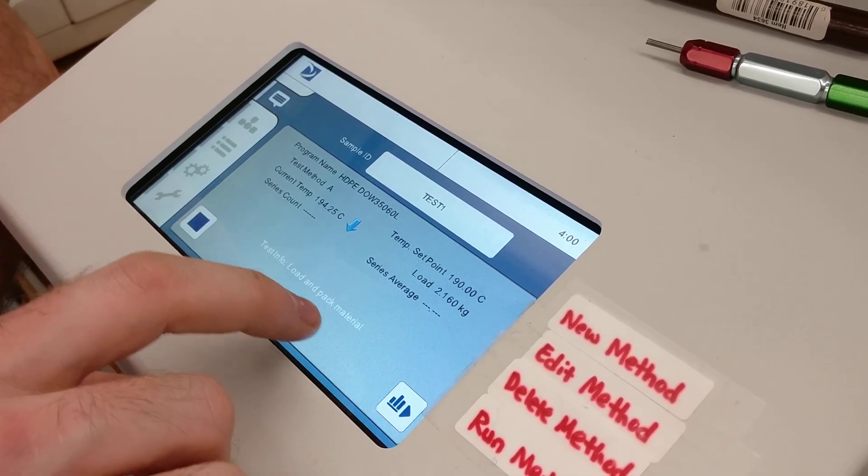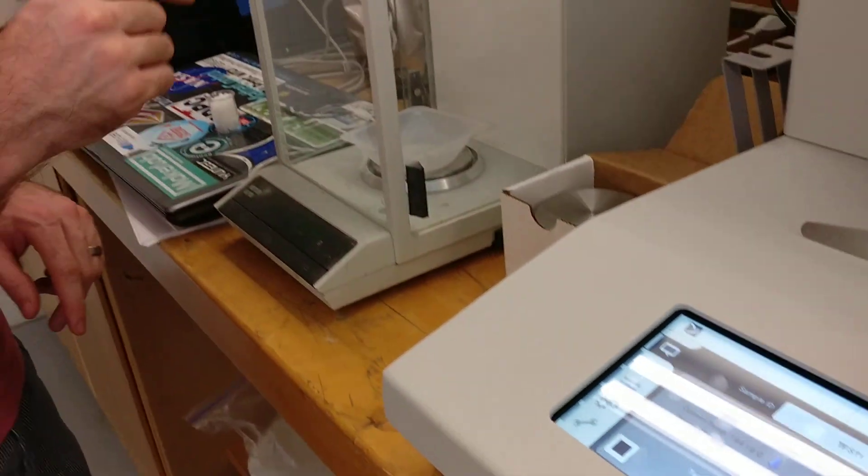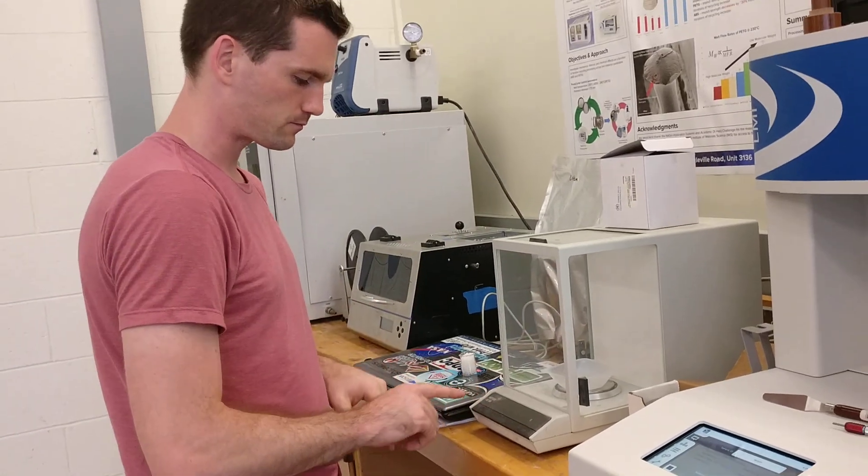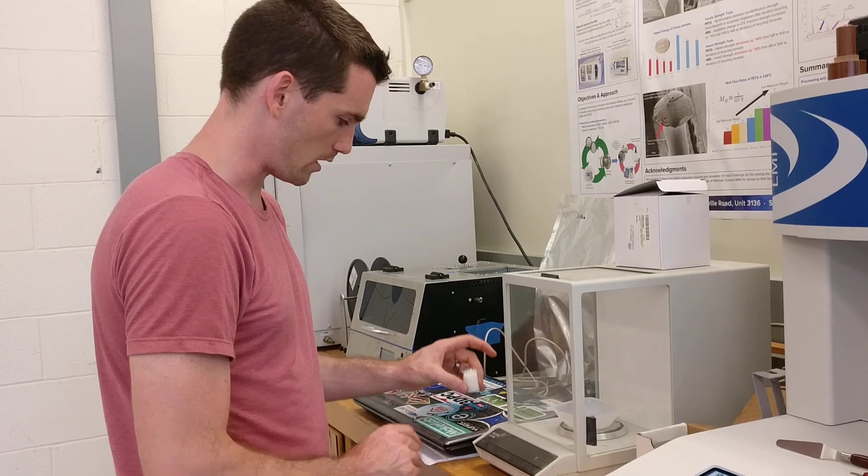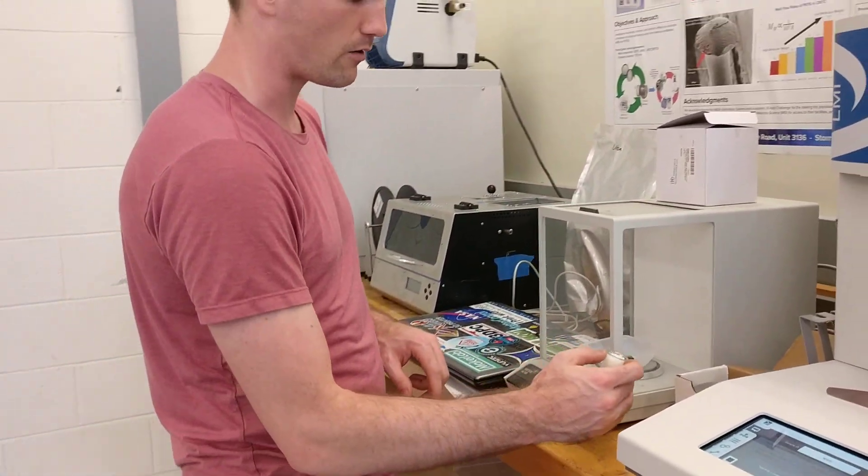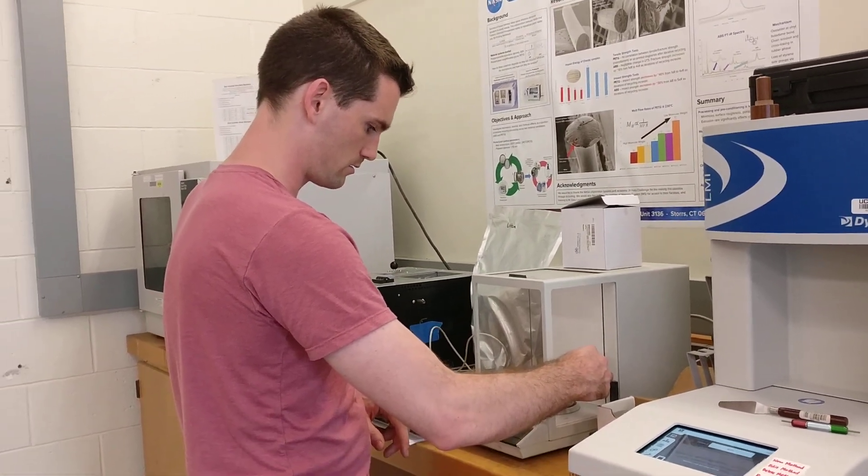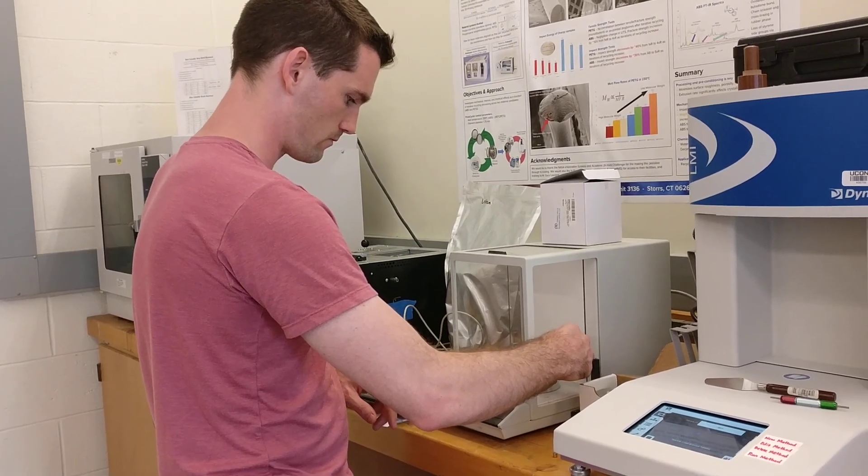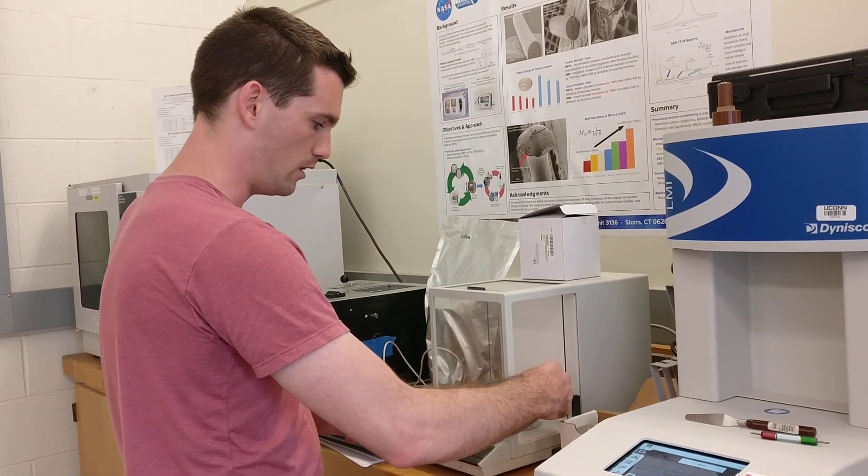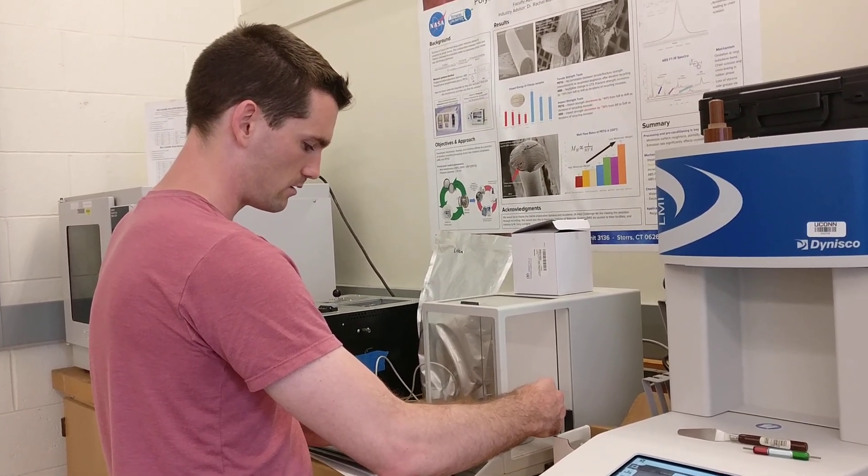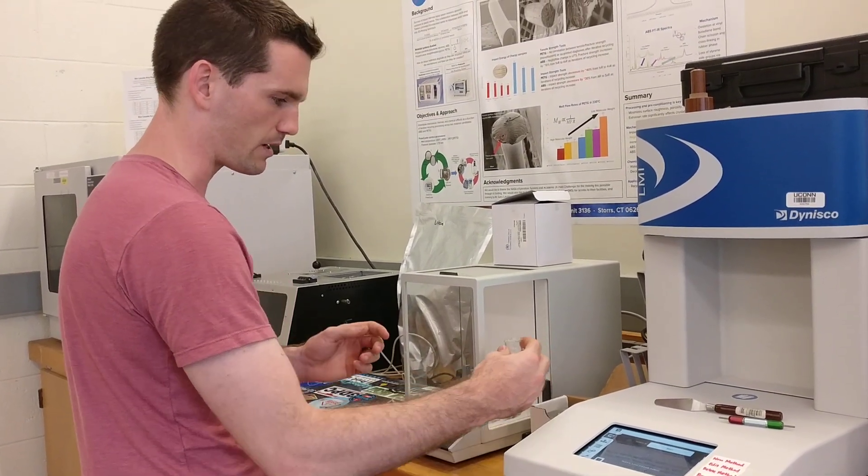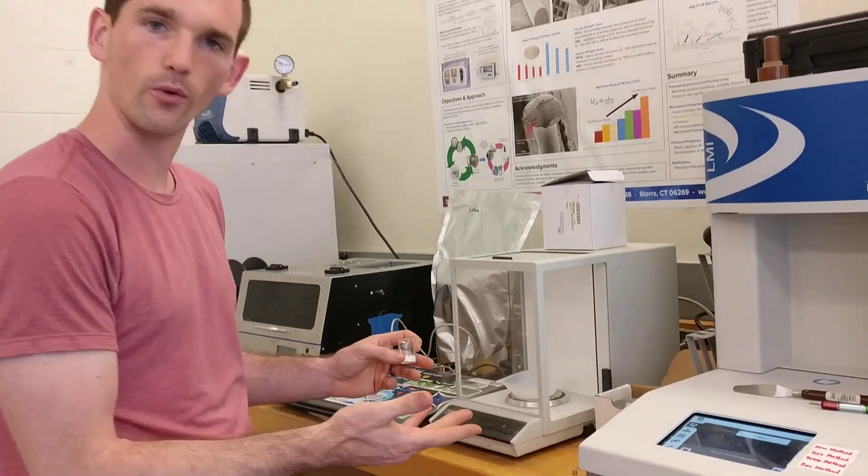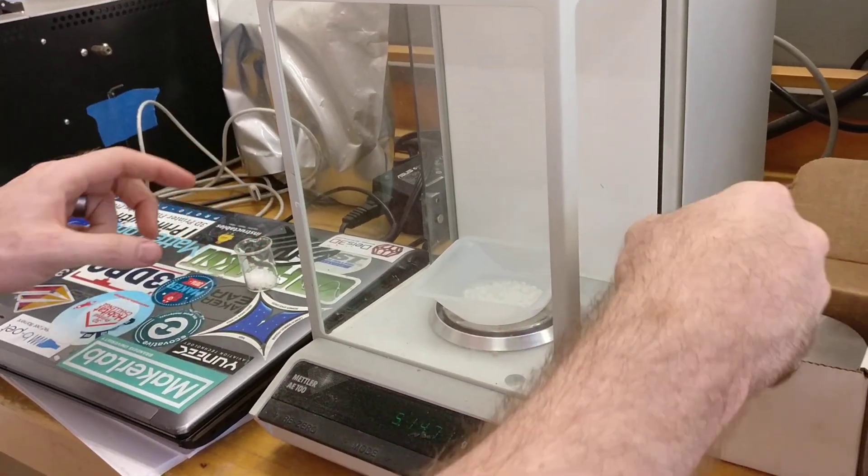At this point, we're going to load and pack the material. Go to the scale here, put one of these weigh dishes on the inside, and zero out the scale with the left button. Then take your chosen polymer pellets and weigh about 5 grams into the weigh dish. Depending on the density of your plastic, it may take more or less pellets. So it's about 5, it doesn't have to be super exact. This is like 5.14.